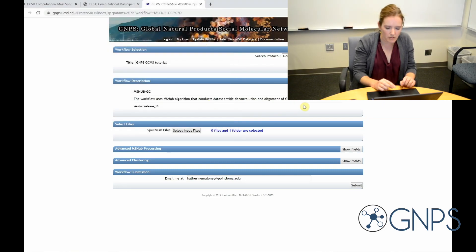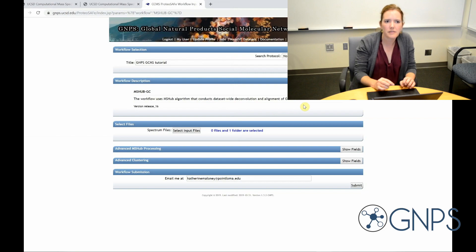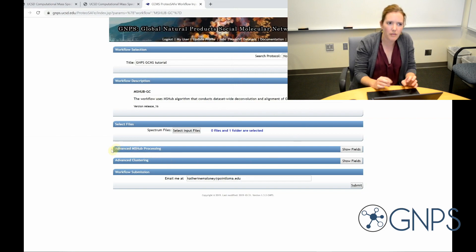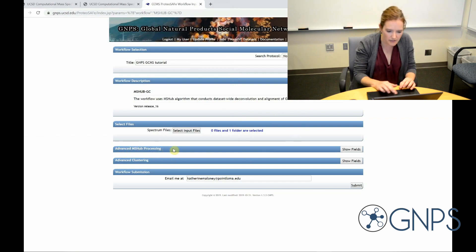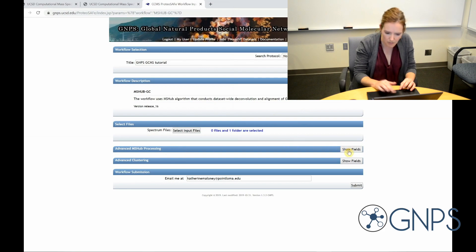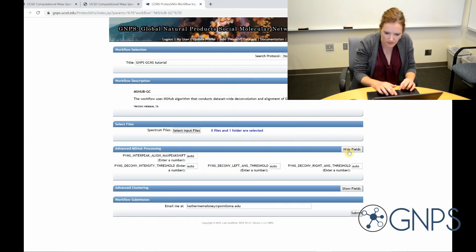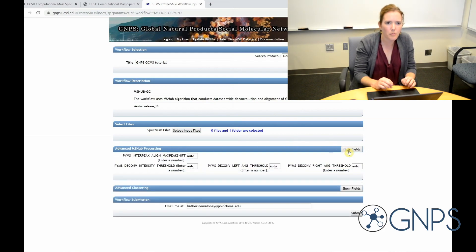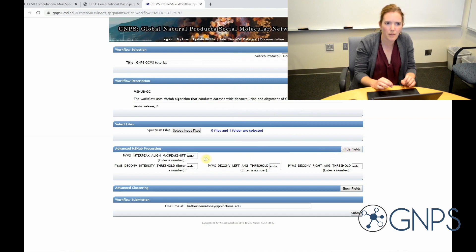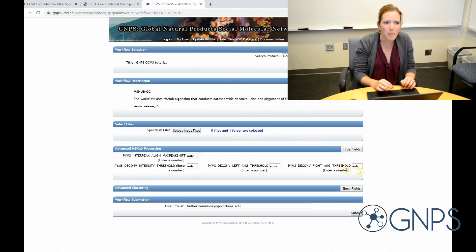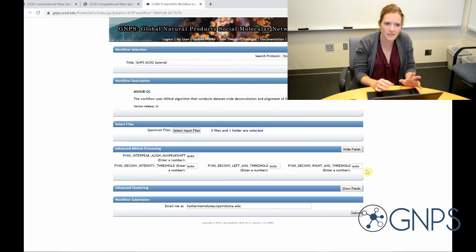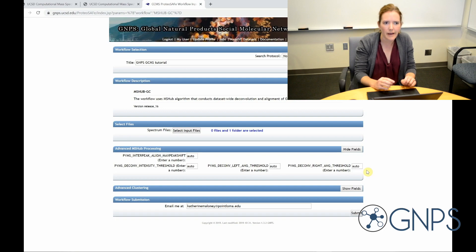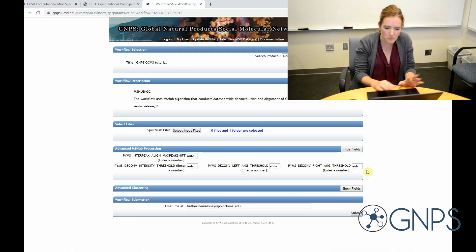Okay, so mshub is the name of this deconvolution algorithm that GNPS uses. And this advanced mshub section has several places where I could adjust the parameters for the spectral deconvolution. But the neural network behind mshub analyzes the data and determines which parameters are optimal for these data. So I'm just going to leave it on automatic.